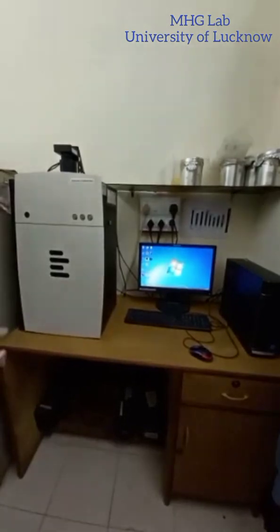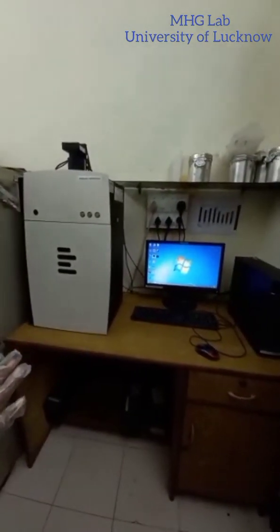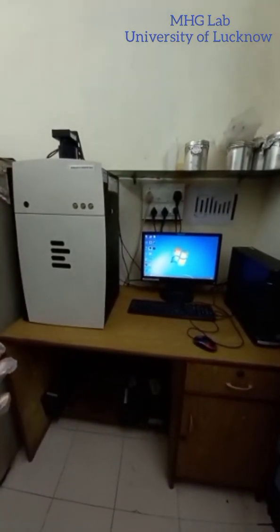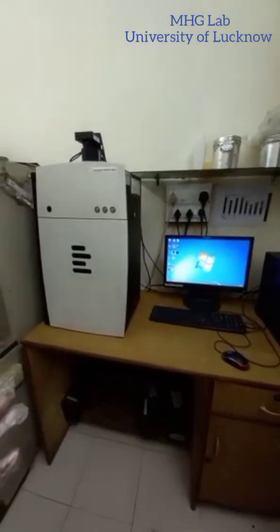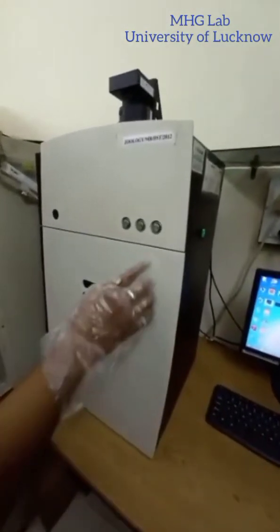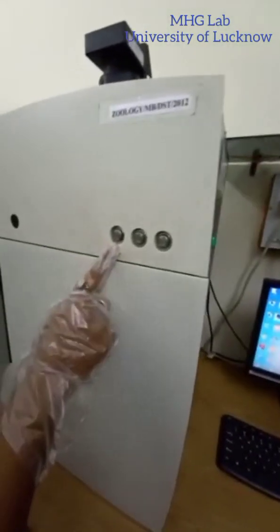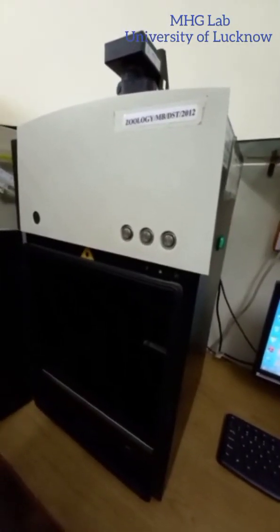This is about John Jen documentation system where we can visualize the DNA we have run in our agarose gel. Here we can see WL denotes the white light we have opened, and from here we can switch on the power.